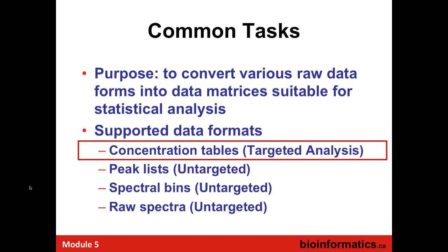Today I'm not uploading raw spectra, because I don't want people to upload raw spectra. It will slow down the site. Yesterday we already used raw spectra with XCMS online. So it's supported, but you won't be able to do that today. I crashed the site earlier last year, multiple times, bringing hundreds of computers down. So, since we're going to have 30 people using this at once, we want to try and keep it fairly free.